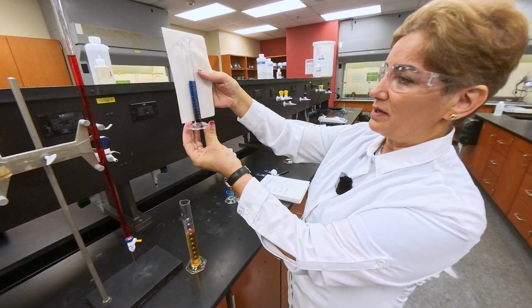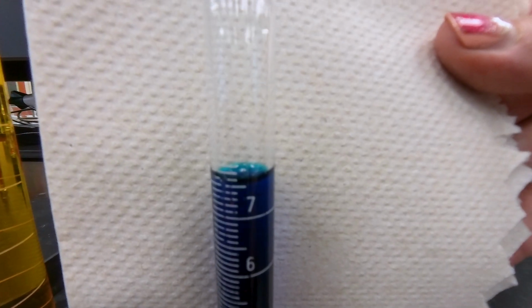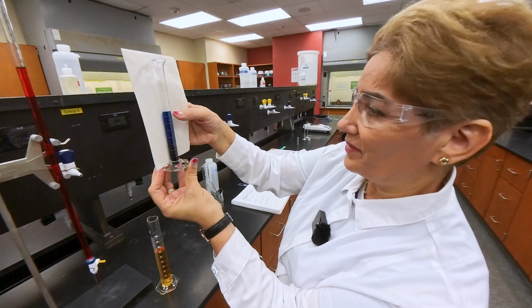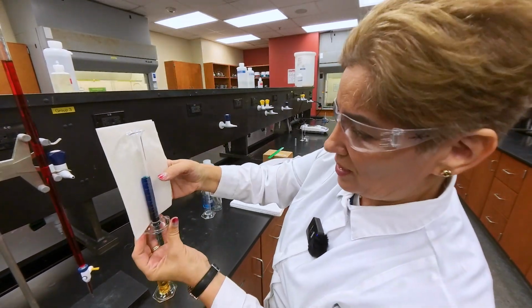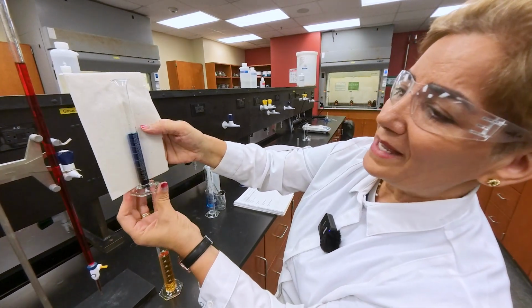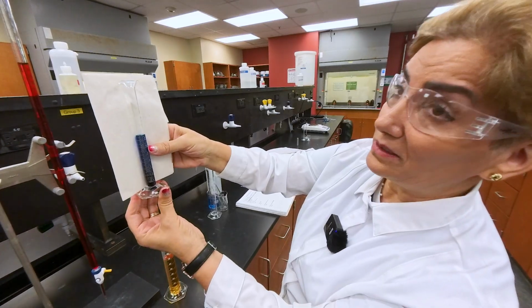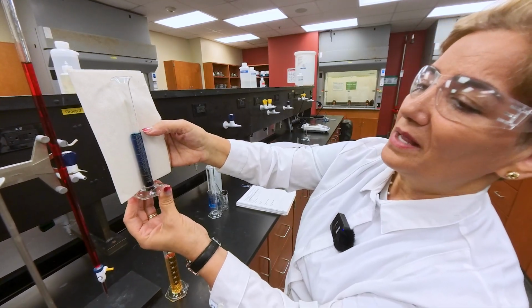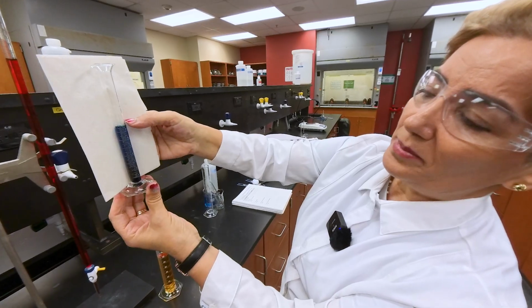So when you are measuring, reading this number, your eyes should be at the level of the meniscus, not too high up or too far down compared to the level of your eyes. And when you look at this measuring device, like the 10 milliliter graduated cylinder, there are some numbers on the device.